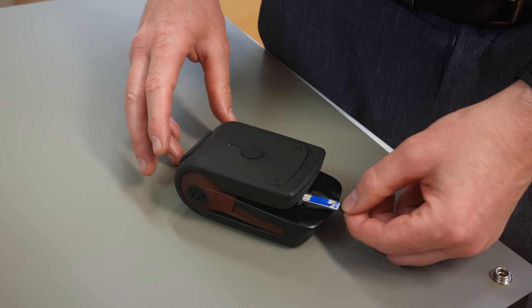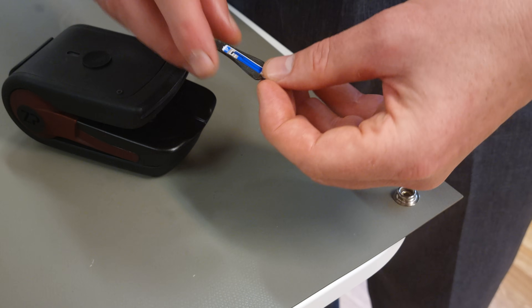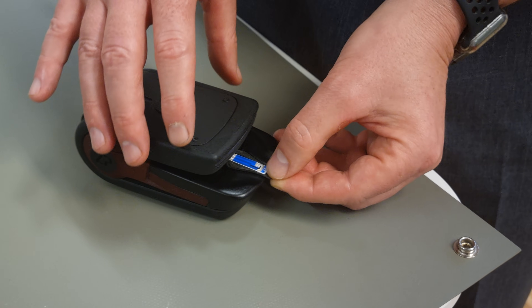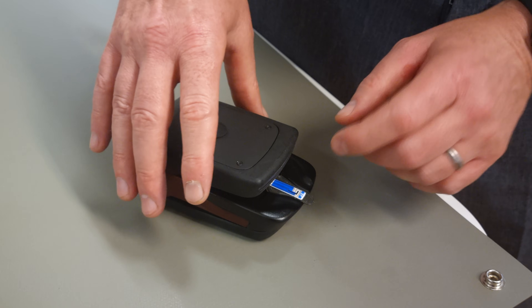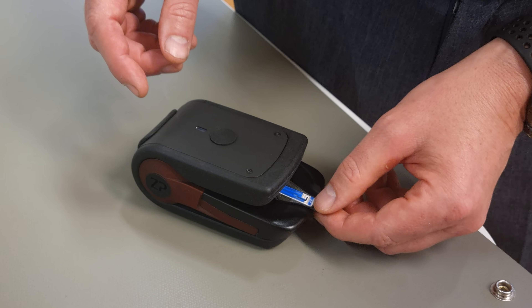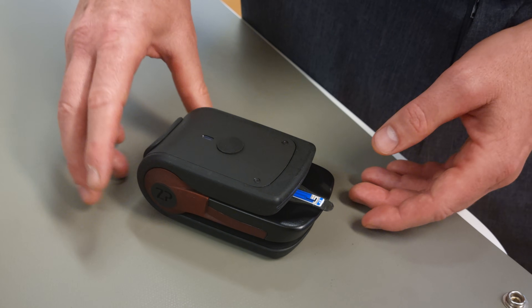What's really elegant about this is that it's not just a screen printed electrode in some manner. It's actually held quite nicely so that you get a really nice mating into the device and it clicks. You can hear that snapping noise, so it's making really nice electrical contact. None of this threading something into a slot, trying to post a letter through a letterbox that's not quite big enough — it slots in really nicely.